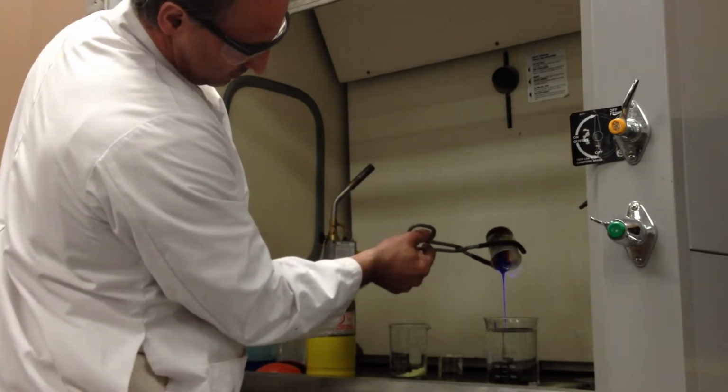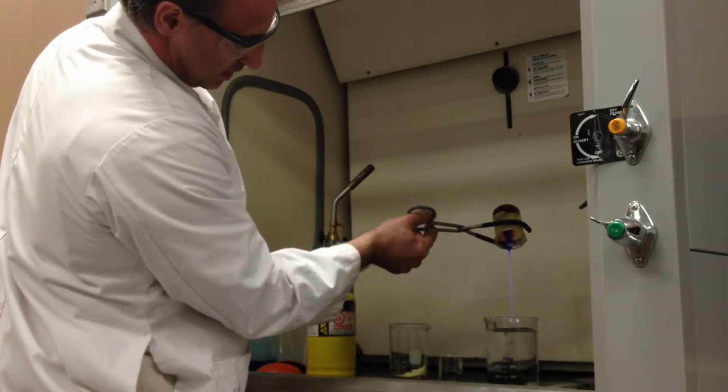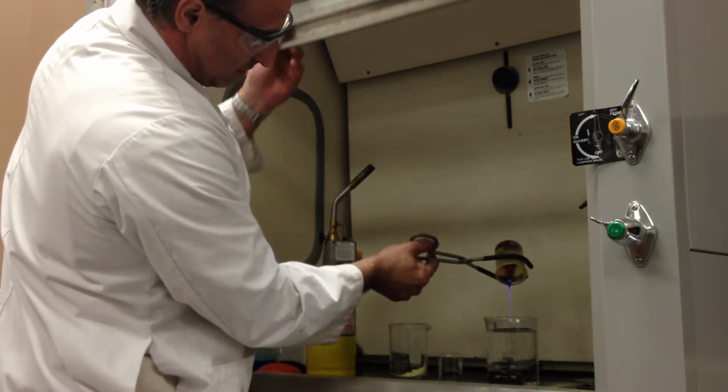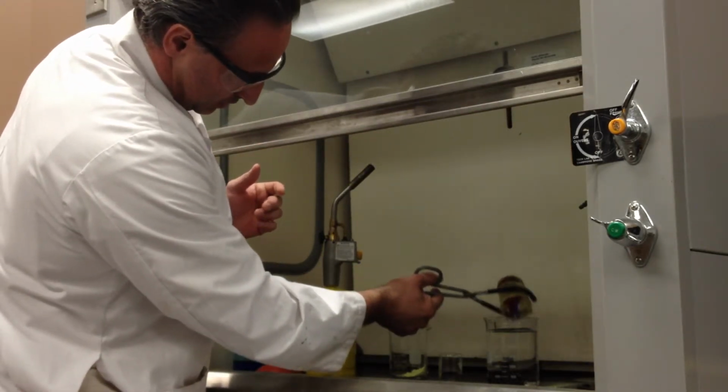Ooh. It's blue. Now it's burning because it touched the hot spot on the beaker. It burns with a very blue flame. That's cool. I'm just going to put that out.